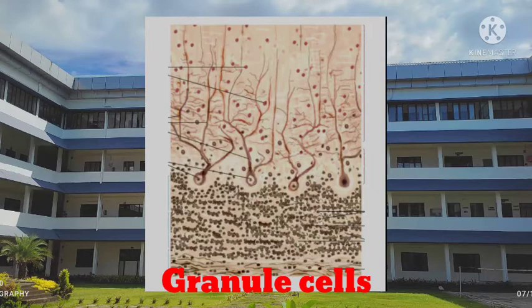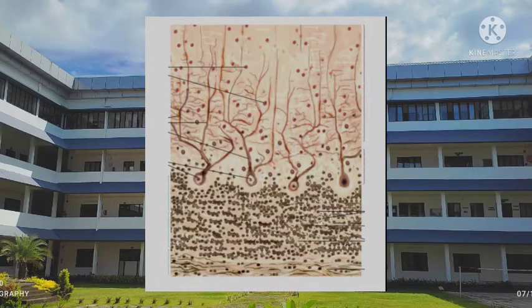The granule cells are very small, numerous spherical neurons that occupy the greater part of the granular layer of the cerebellum. The spaces not occupied by them are called cerebellar islands, and the islands are occupied by spherical synaptic structures. They are called glomeruli.